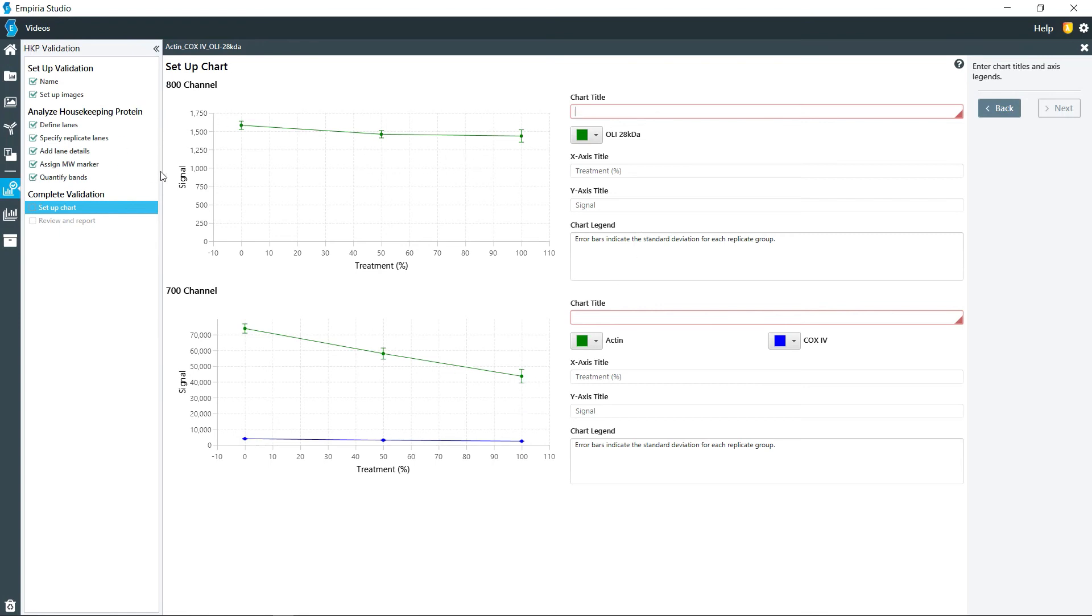So you have all of that right there. You have the chart title. I'm going to say OLI and then also actin COX-4.